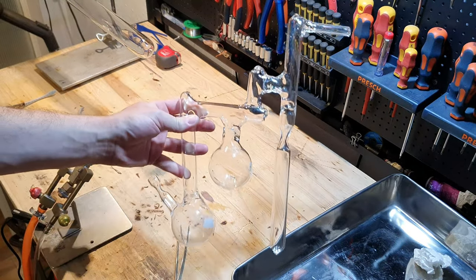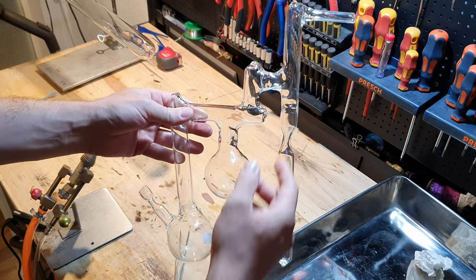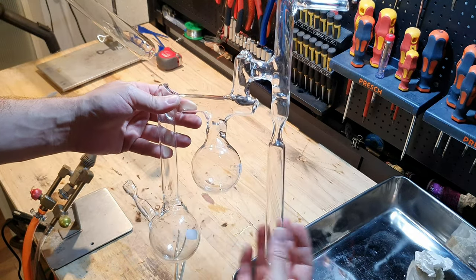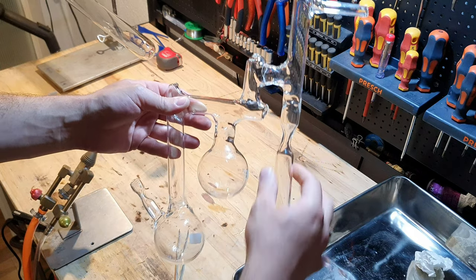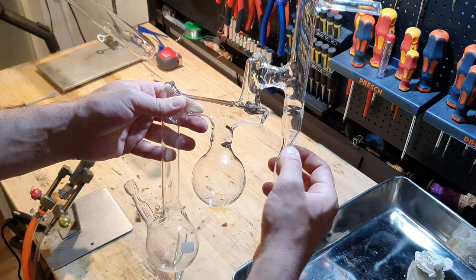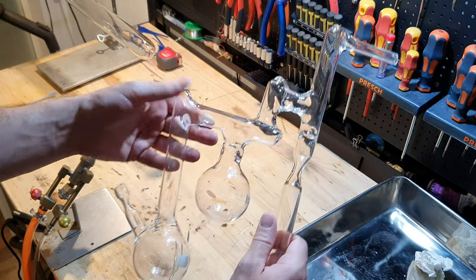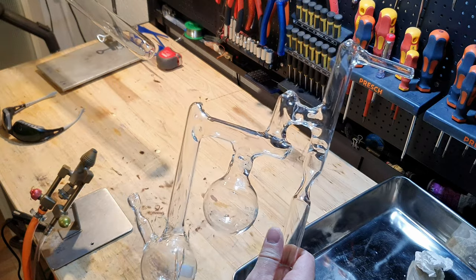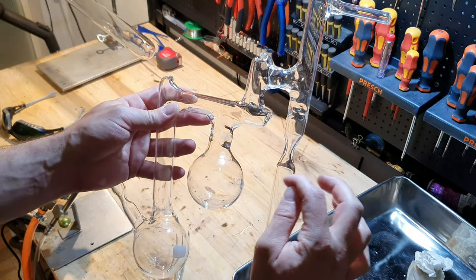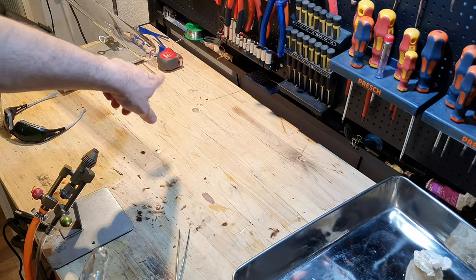My plan is to use this 100ml still — it has 100ml flasks. I already built it a while ago and I want to seal the larger vial onto here. The reason is that I have to create this neck here where I can seal the ampule under vacuum. And the problem is that I am not confident that I can do it with the large diameter tube.